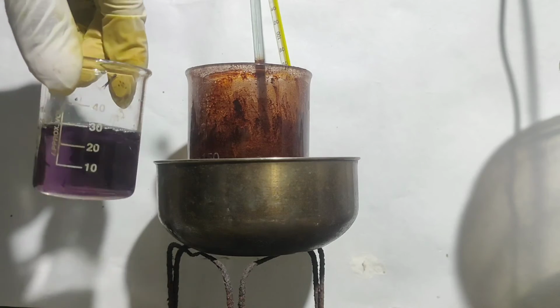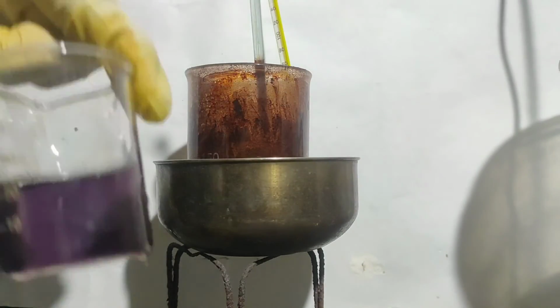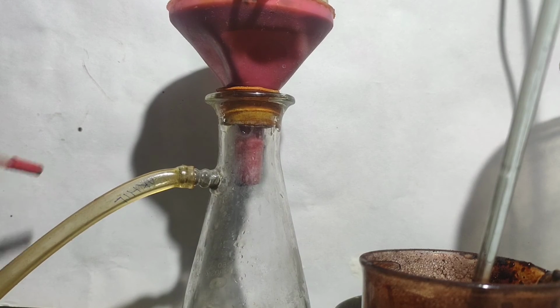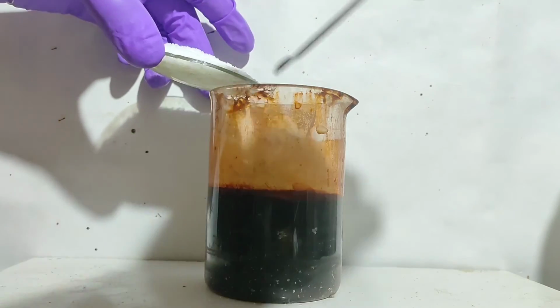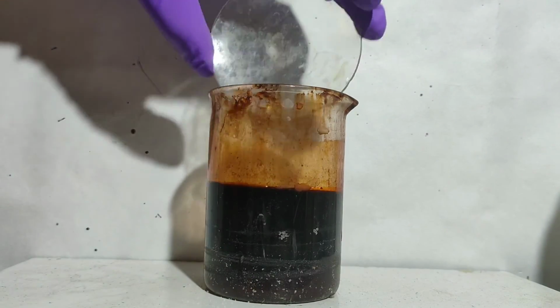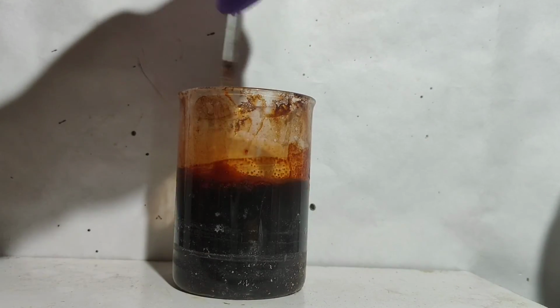It is similar to that of Congo Red prepared by Magpie, but as far as I know, Congo Red is blue in acidic medium. I vacuum filtered the reaction mixture to remove the insoluble tar and washed it until the filtrate was only light red in color. To the filtrate, 40 grams of sodium chloride was added to precipitate Congo Red as the disodium salt. It was stirred for some time and then vacuum filtered.